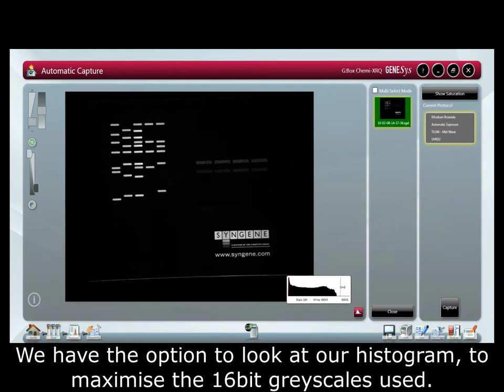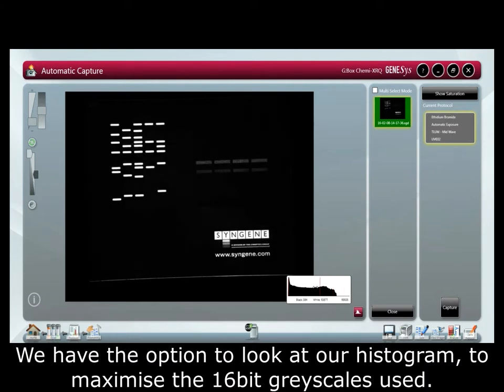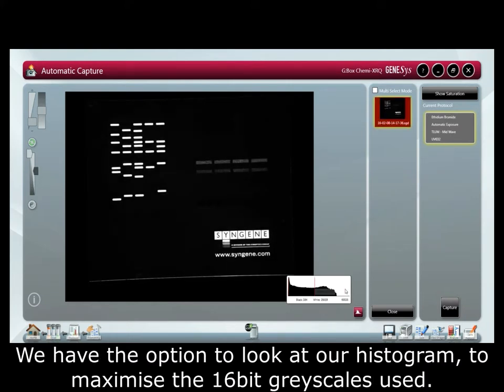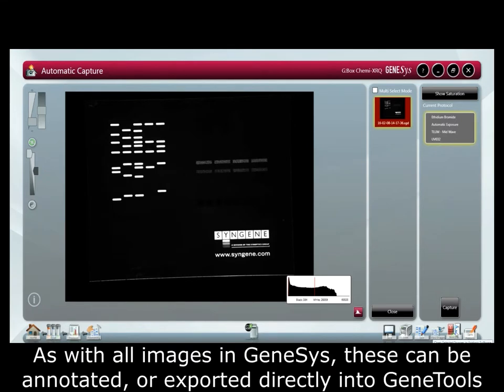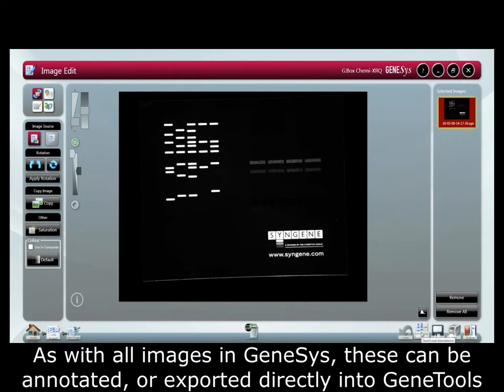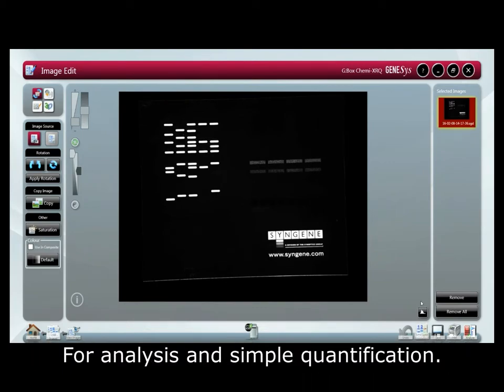We have the option to look at our histogram to maximize the 16-bit grayscales used. As with all images in Genesis, these can be annotated or exported directly into gene tools for analysis and simple quantification.